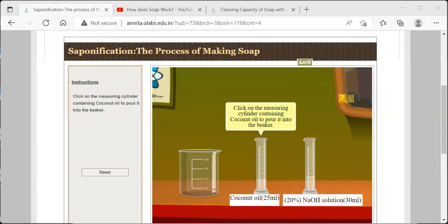In this video, we're going over the experimental procedure of Lab 13, which is titled Synthesis of Soap. This lab has 3 different components in terms of the experimental procedure. First, there is an OLABS that explains how, through the process of saponification, a soap is made.